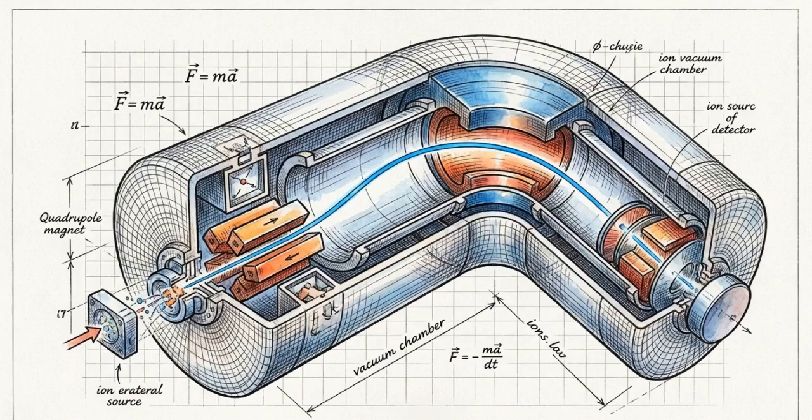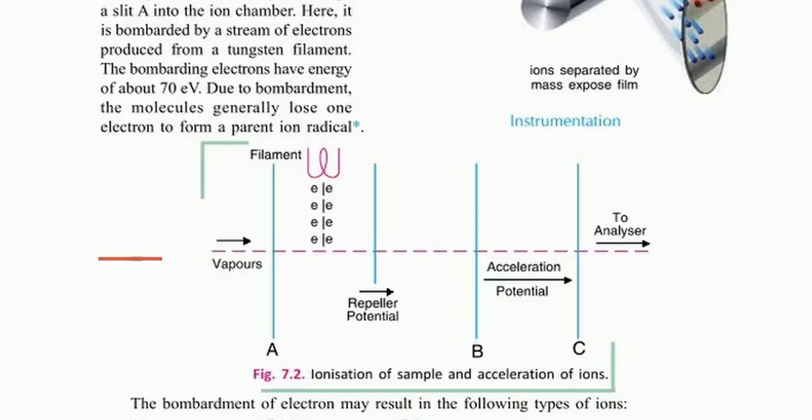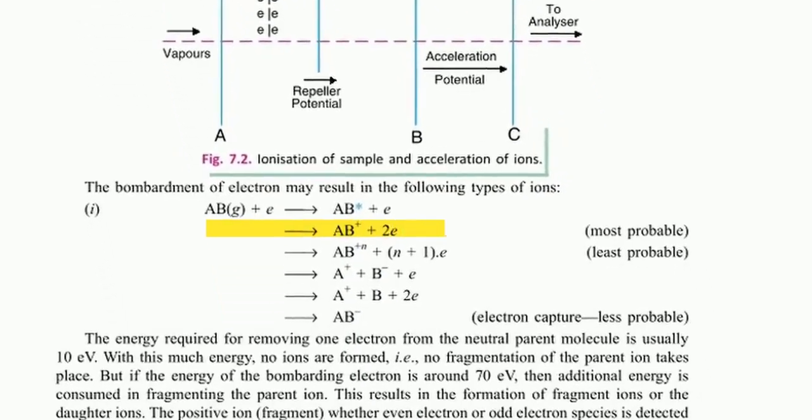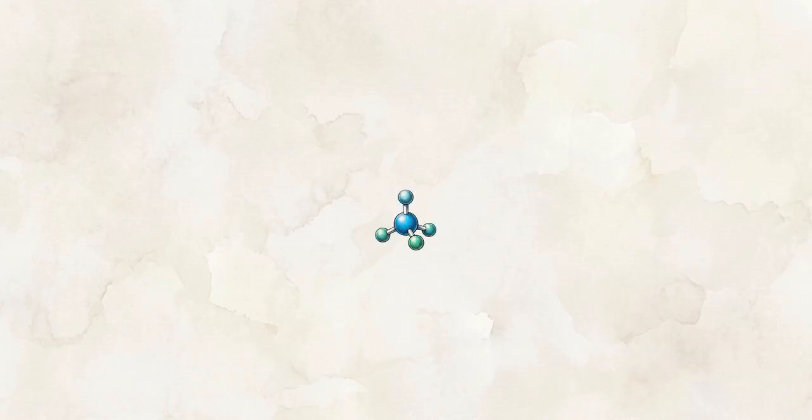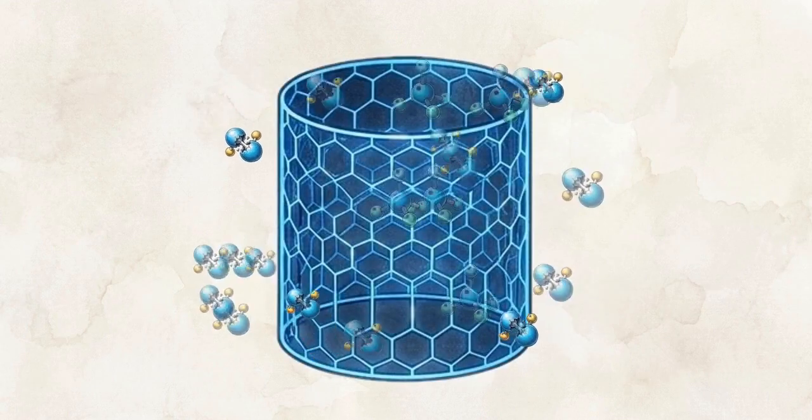To track a molecule through these 5 stages, we have to look at the sample through the lens of physics rather than chemistry. This schematic shows the ionization chamber. After neopentane is vaporized, it is subjected to a violent bombardment by an electron beam. The collision knocks a single electron off the molecule, leaving a positively charged molecular ion that retains the exact mass of the original neopentane. But this electron impact is so harsh that it causes many of the neopentane molecules to structurally shatter into smaller pieces.